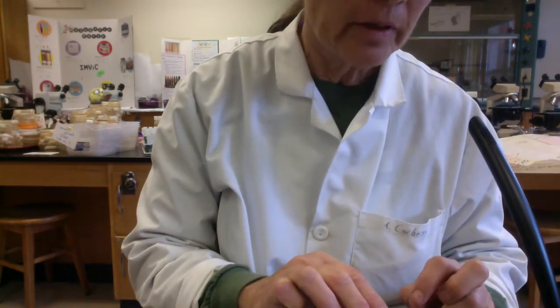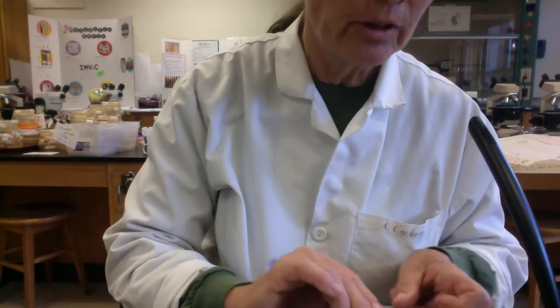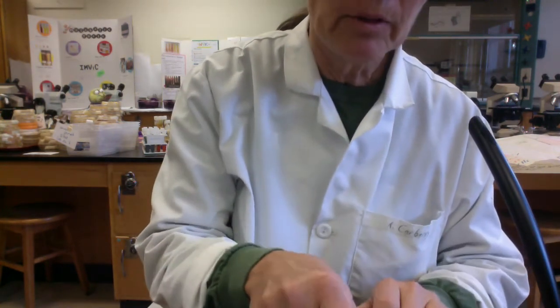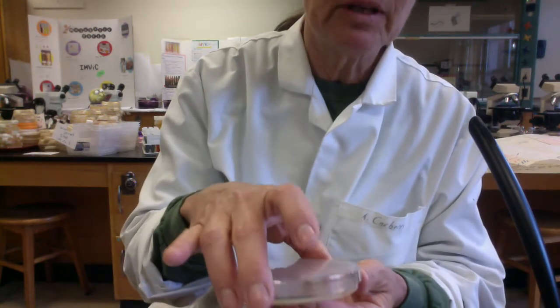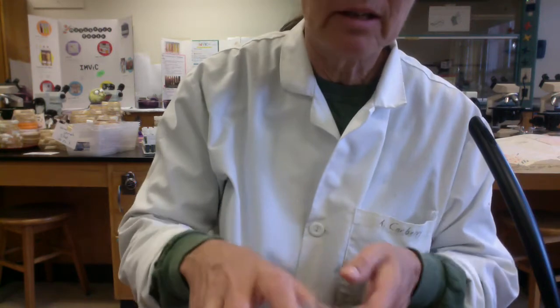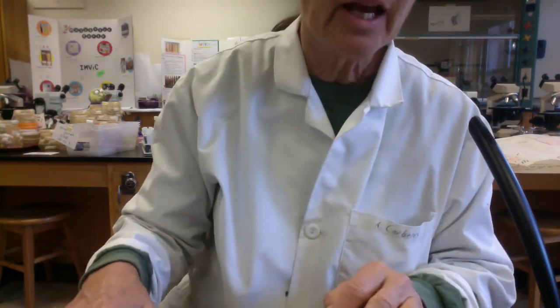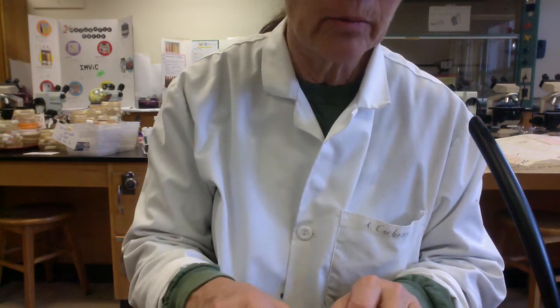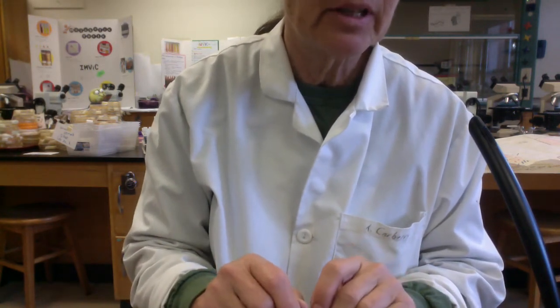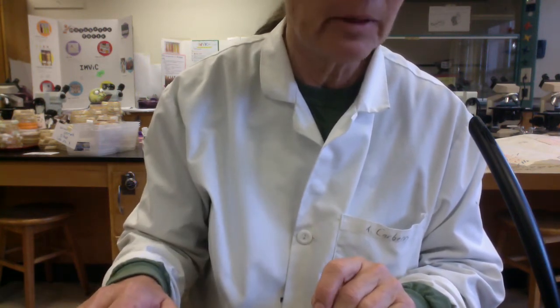So the way the experiment runs is you'll have a timer, and at time equals 0, you'll keep the lid on the 0-minute plate, your negative control, but you'll take the lids off your 30-minute plates and lay them on the counter, and you'll also take the lids off of your 60-minute plates and lay them on the counter. After 30 minutes exposure to the airborne microbes, you'll replace the lid on the 30-minute plate. Likewise, after 60 minutes exposure to the airborne microbes, you'll put the lid on the 60-minute plate.